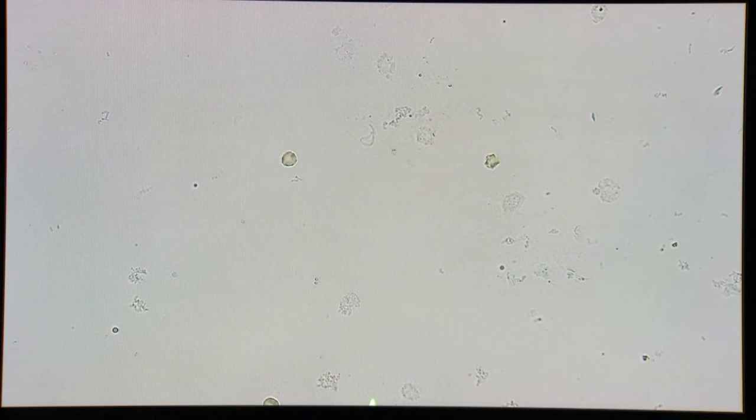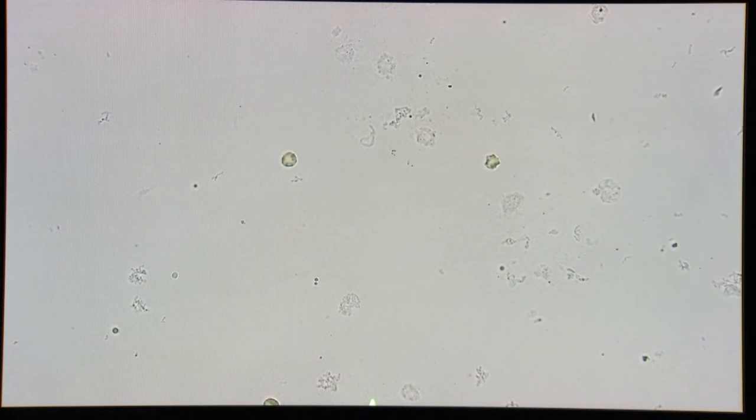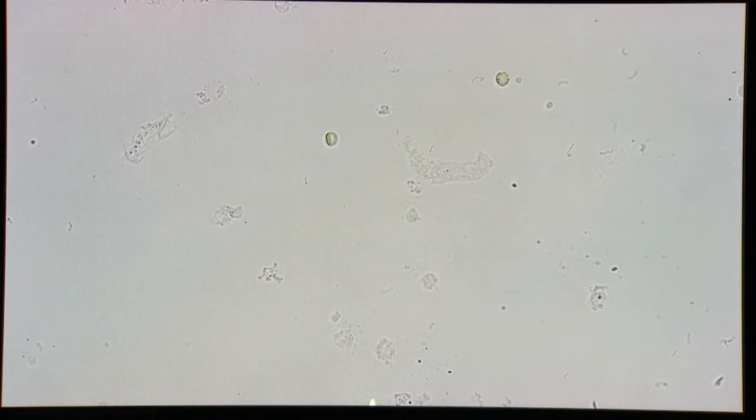For cells, you count what you see in approximately 5 to 10 fields and take the average.